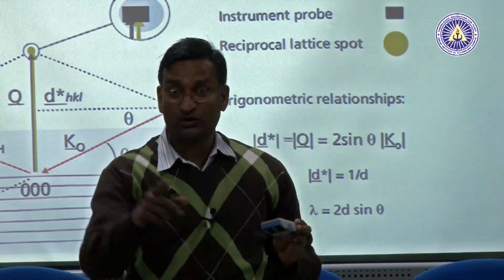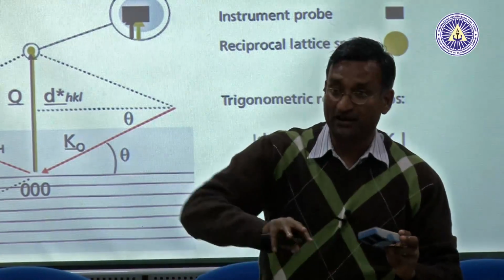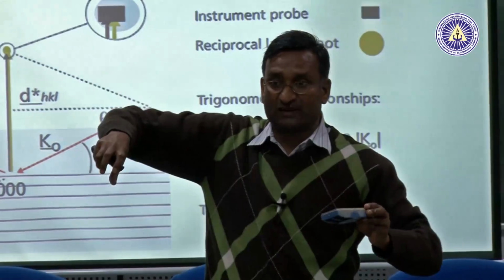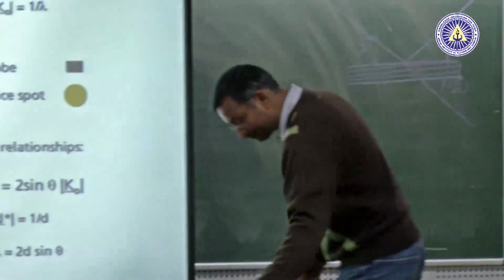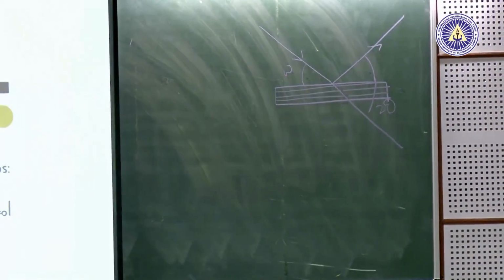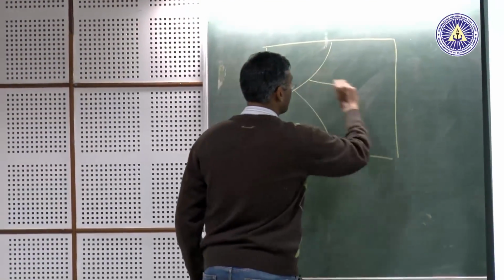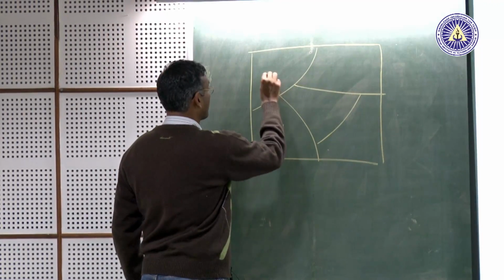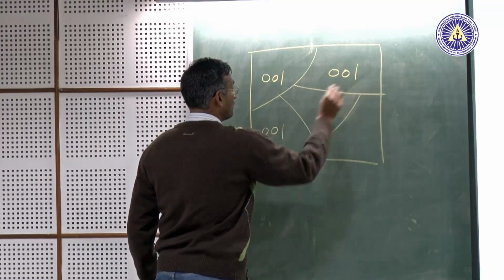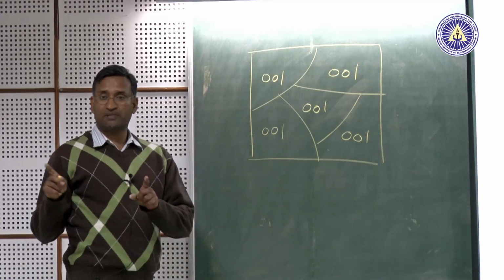It is like if you look at a mosaic floor. A mosaic floor will have all the grains aligned at certain angles with respect to each other. So, if I look at the sample from top, and let us say I divide the sample into various sections, all of them are the same 0, 0, 1 plane, but the 0, 0, 1 plane has a certain direction.